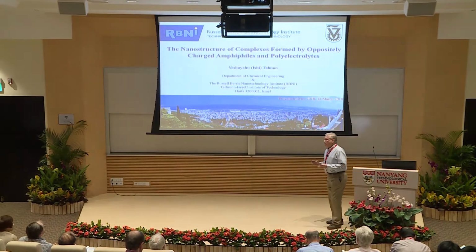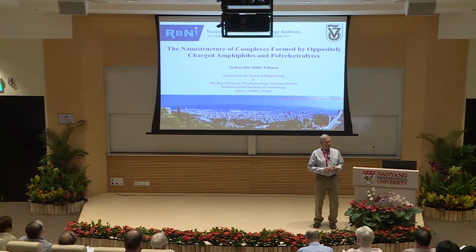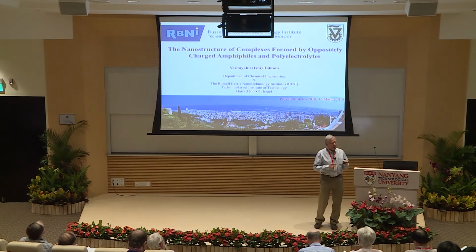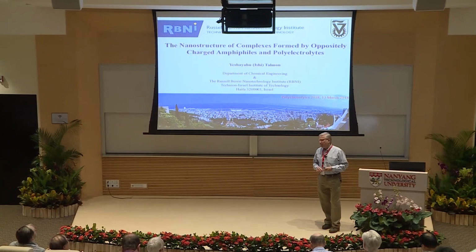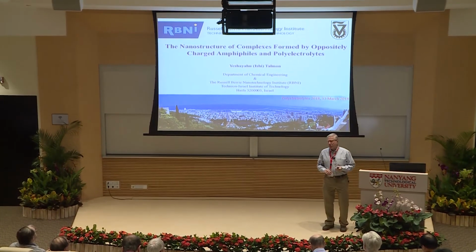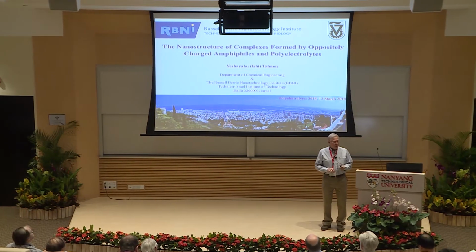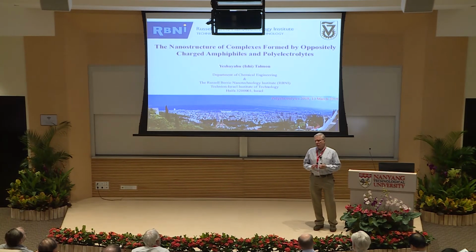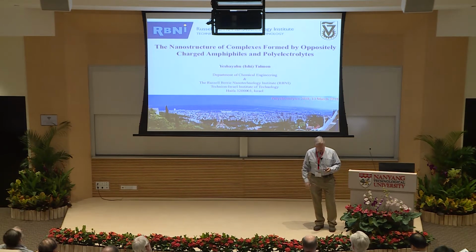So basically what I would like to do today is describe how, by using cryo-TEM, we can look into the structure of the complexes that are formed by polyelectrolytes and by oppositely charged amphiphiles and lipids. The emphasis is on the connection between the nature of the molecules, the complexes that are formed, and their function on the macroscopic scale.